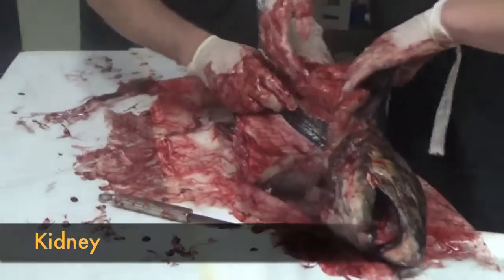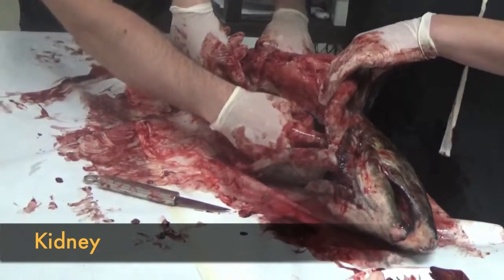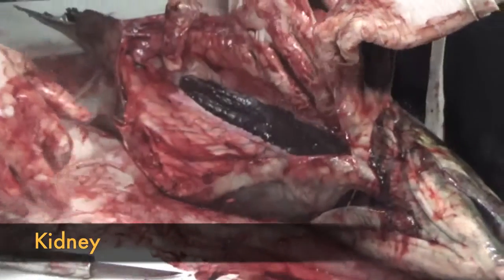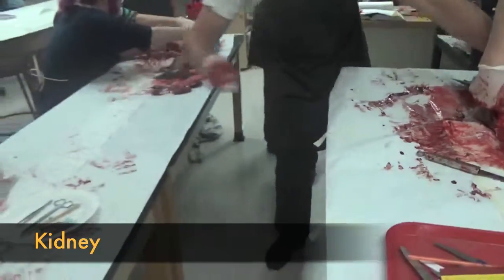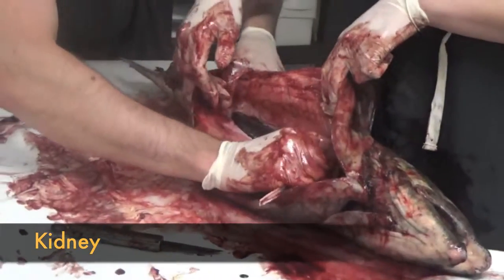Below where the swim bladder is, you'll see a dark section in here — this is the kidney. You want to take your spoon and scrape it out, kind of like a Halloween pumpkin.